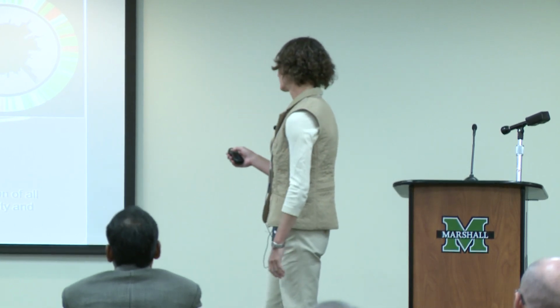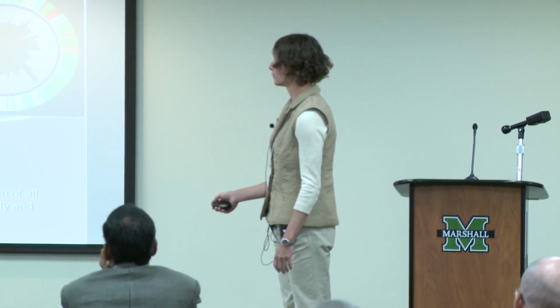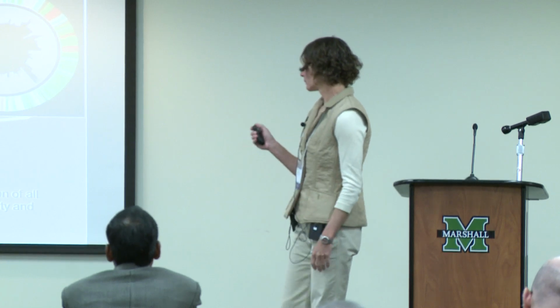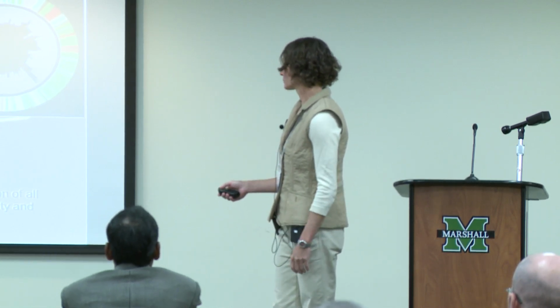in an unbiased way. So just as an example, Gary will take a sample of water from the Ohio River or some other local water source, and we will filter out all the bacteria, all the algae, everything that's living in it, prepare DNA en masse from those organisms, and sequence it. So this is sort of metagenomics. And what we want to learn, a couple of objectives of this sort of project.